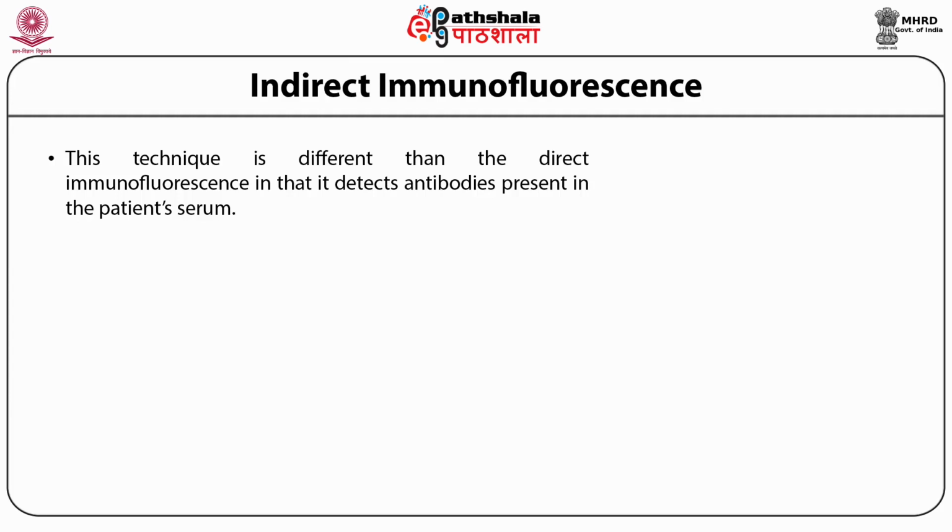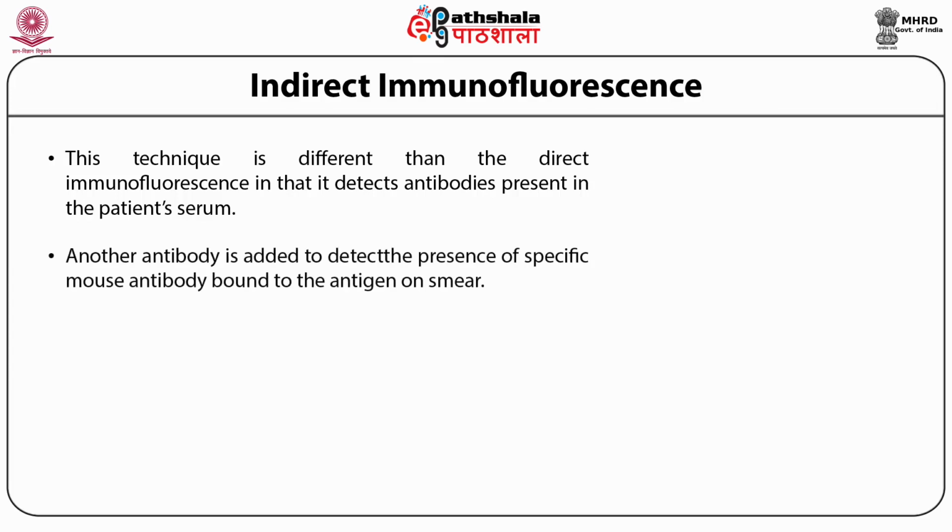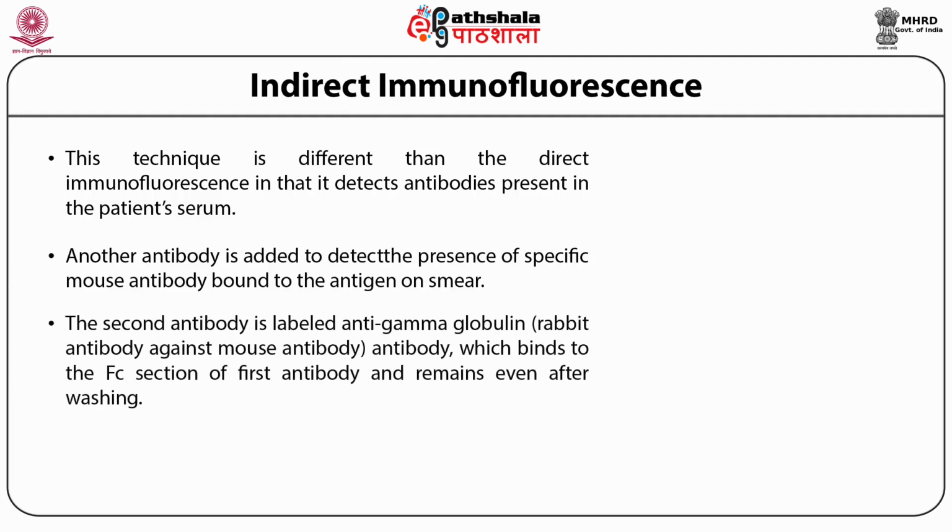The unbound antibodies are then washed off. Another antibody is added to detect the presence of specific mouse antibody which is bound to the antigen on smear.